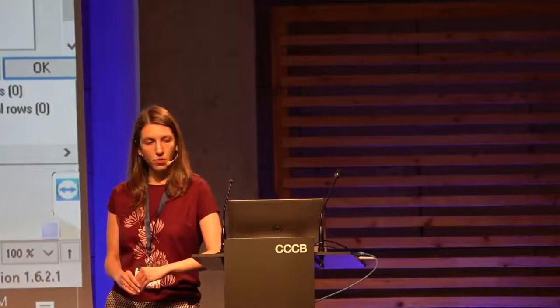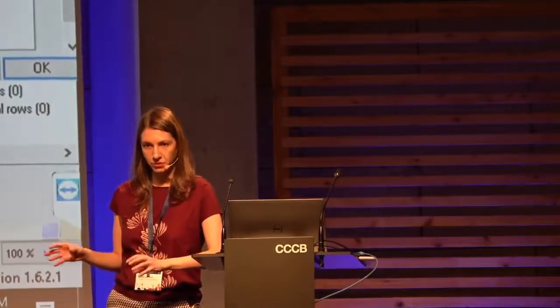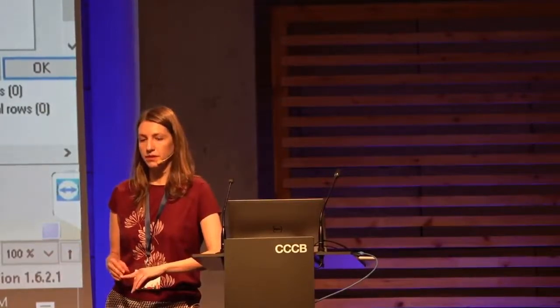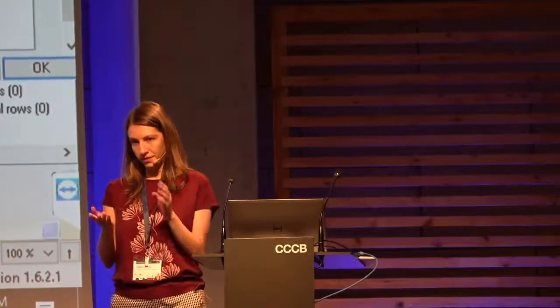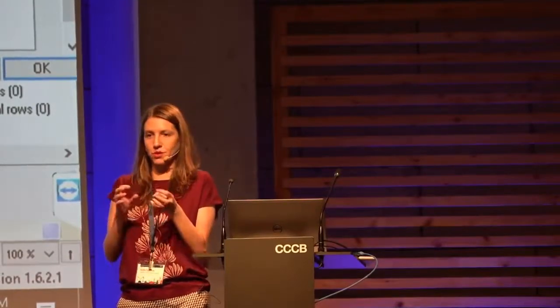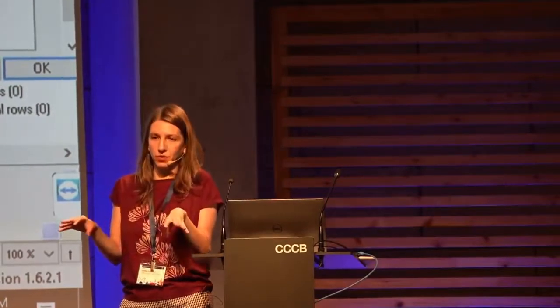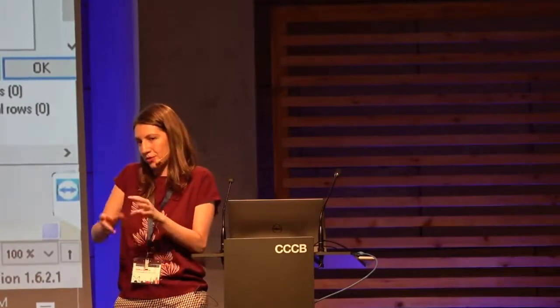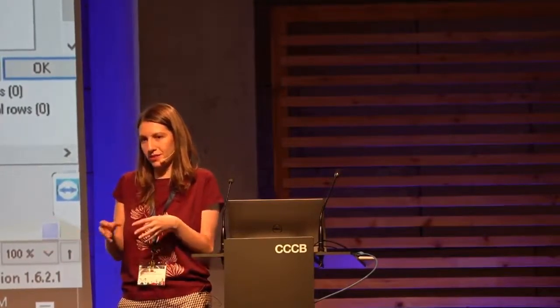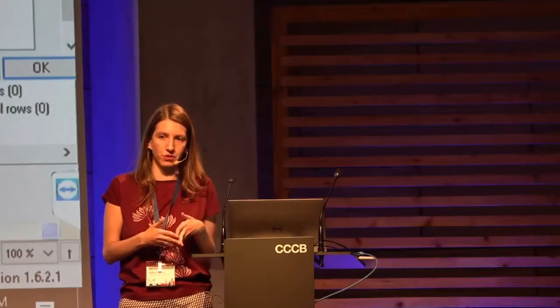This is indeed one possibility, to use some sort of machine learning method to impute this. The problem in this case is that you're already going to imply some structure in your data, right? So for the k-means, it already means that it will have an idea of your different groups. So you'll be already imputing values, sort of helping to shape your different groups. And this is, again, something that you don't really want to do. You don't want to use any prior knowledge of what your grouping might be when you do this imputation.